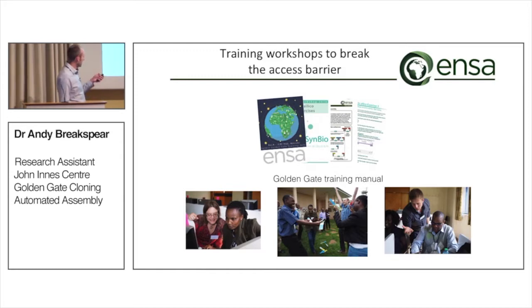So we learned a lot from this, and I think the major criticism of this instruction booklet was that we were using commercial software to design the in silico maps for our constructs, which is a great way of checking your designs for Golden Gate. And so we replaced those bits of software with freely available software, so anyone that had access to the internet could build these constructs.